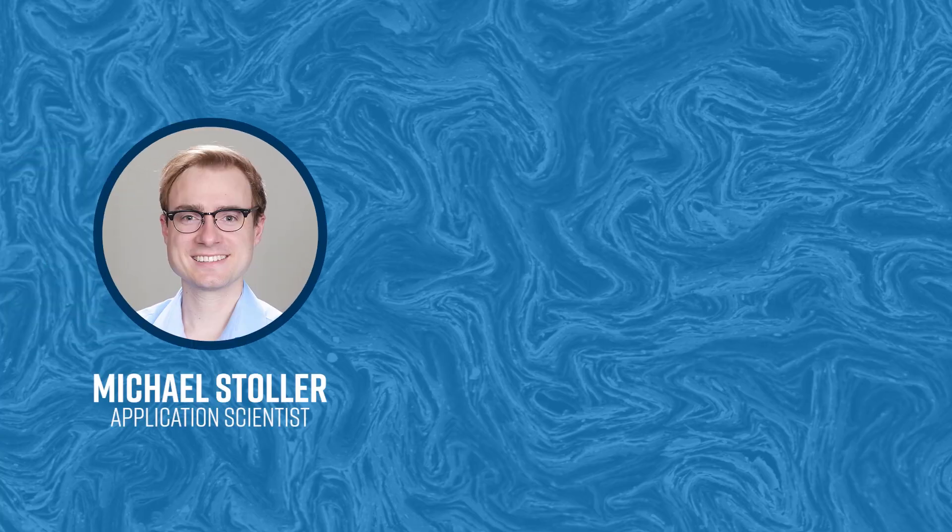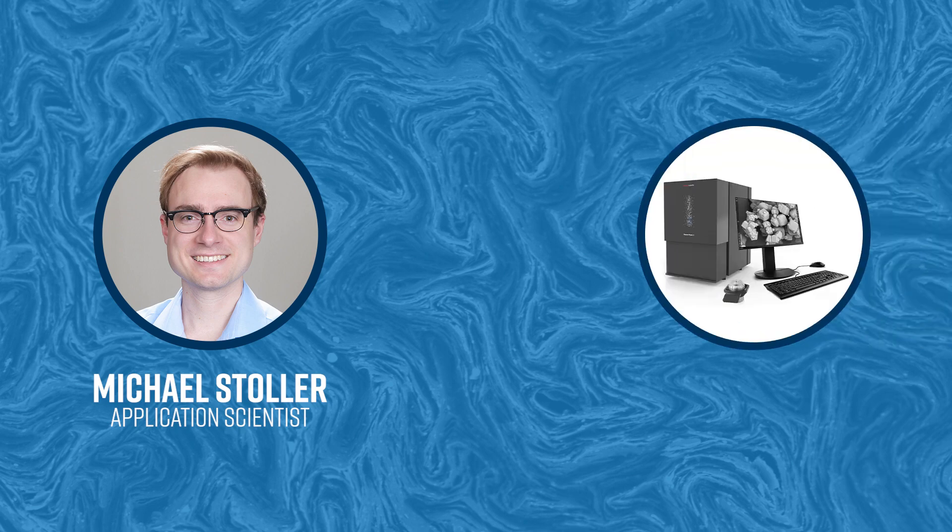Hi everyone, my name is Michael Stoller and today I would like to demonstrate loading a sample into our Phenom Feros MP series desktop scanning electron microscopes.